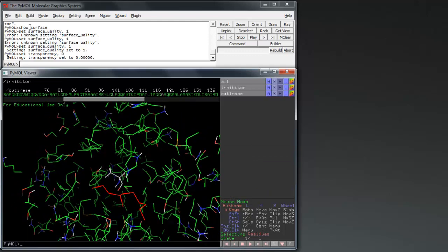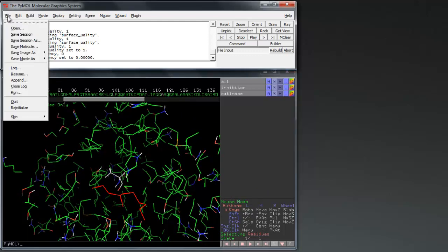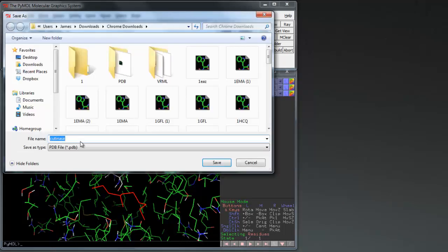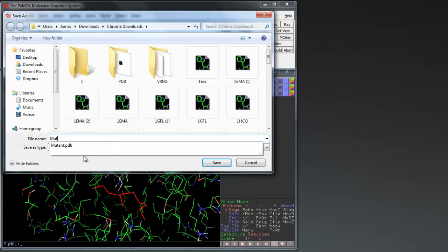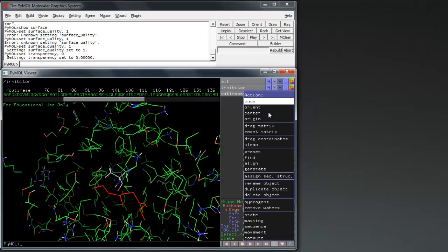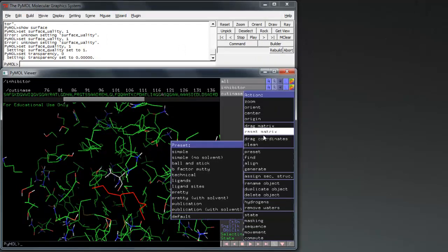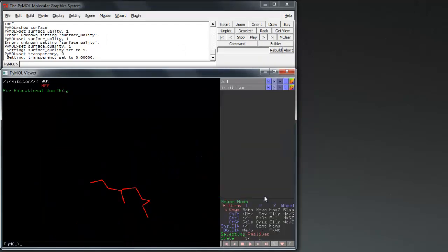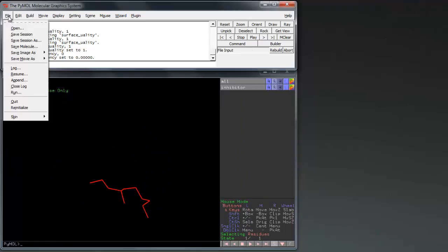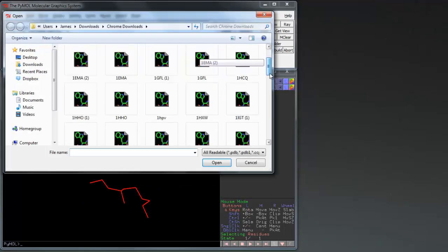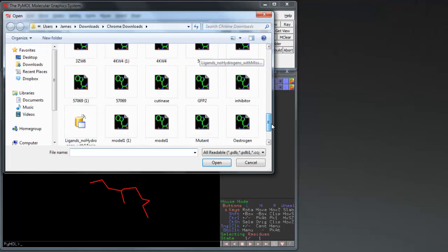File and save the new molecule as a mutant before deleting the object. Open up the original enzyme and the mutant so we can compare them side by side.